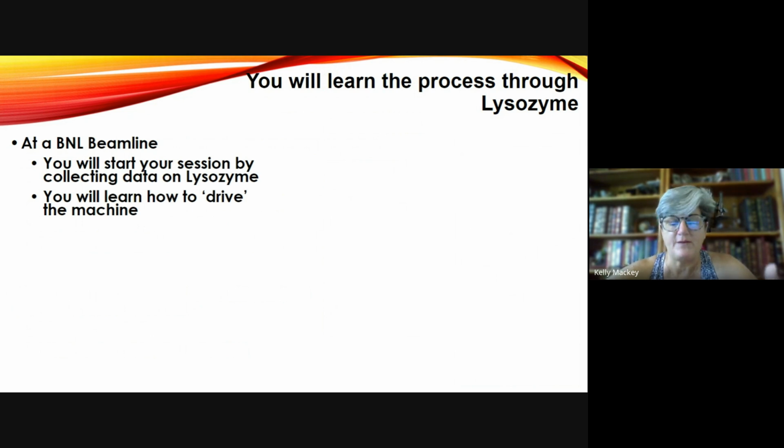We have FMX and AMX and NYX. And there, as Mr. Boland was saying last week, they get updated there. They get new software, they get new equipment. So just about every single time we go, there's something new going on. So we figured lysozyme, we know what a crystal looks like. We know how to do it. It'll serve as everybody's training session when we are actually on site.